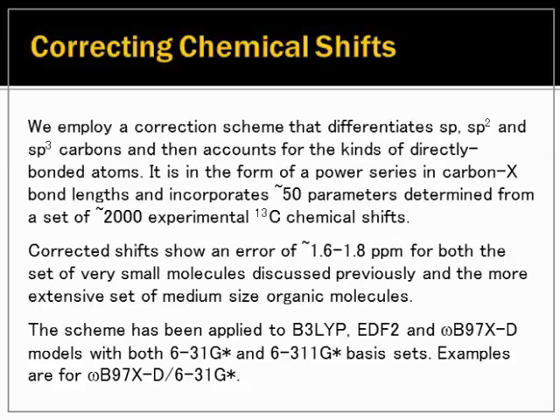The way that we've chosen to do this is to empirically correct, and we've developed over the years 3 generations of corrections. The current version of Spartan incorporates the last one. And what we've essentially done is to start with the calculated one, that's the lead term, and then introduce a term that looks at the neighbors.